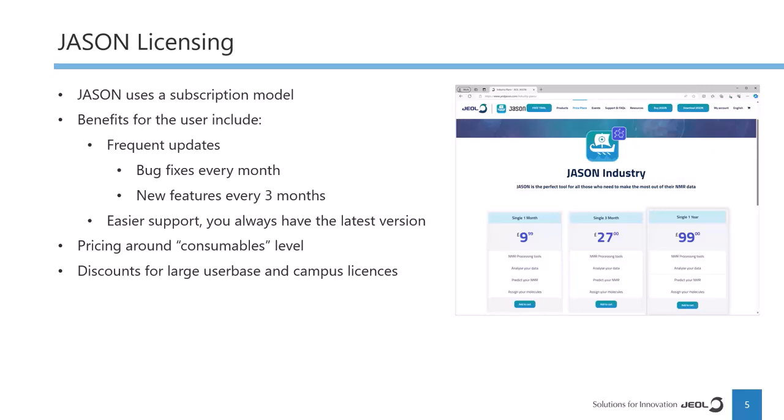Now, the pricing of Jason is designed to be around consumables level. The base cost for Jason itself is relatively inexpensive, and we do have discounts available for large user bases and campus licenses.